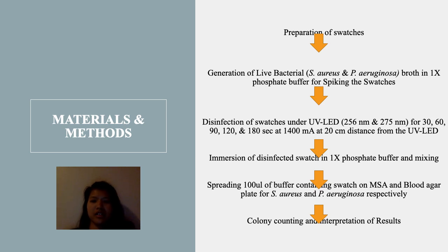After disinfecting them, we immediately suspended them in phosphate buffer, mixed them, and we did spread plating using 100 microliters of the phosphate buffer onto MSA plates for Staphylococcus aureus and blood agar plate for the Pseudomonas aeruginosa samples.